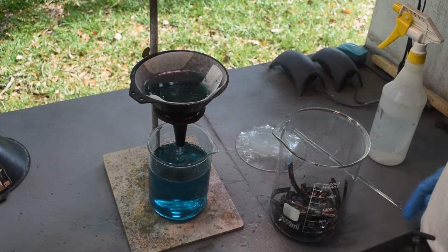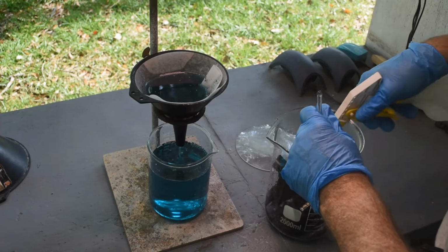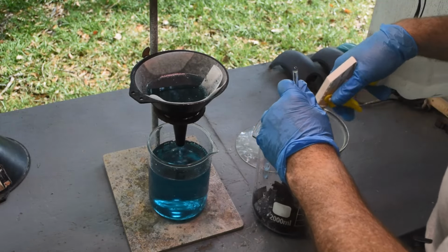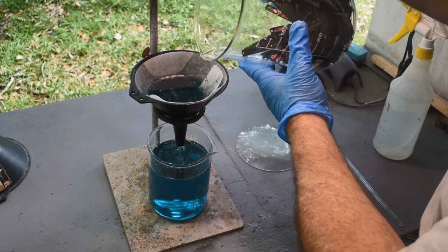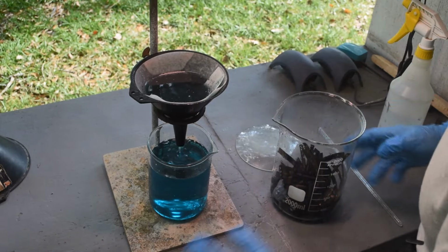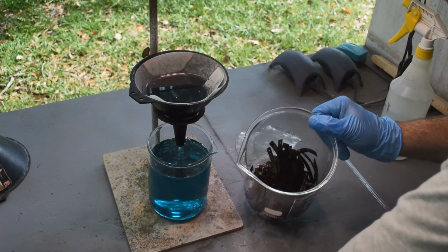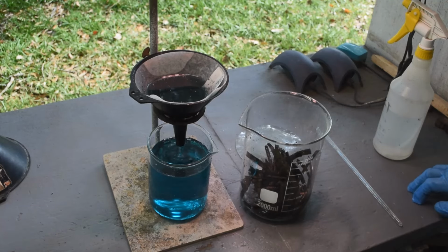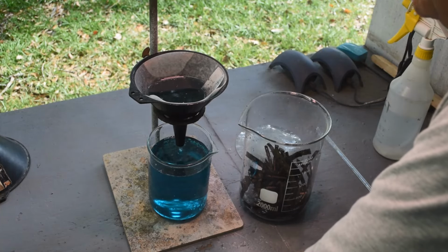All right. So I suppose another way to separate the palladium, Joven, would be to just keep rinsing this stuff with water and stirring it, and then pouring off the water, which contains a whole lot of the palladium. So that's one potential way of doing it. I seem to be getting a whole lot of it in this filter. What else am I getting in the filter, though? That's a good question. I see some dark colored debris. I wouldn't be surprised if there's a little bit of the copper that's flaked off of the substrates in there. So refining the palladium might be necessary before just melting down what's in the filter here to make little ingots of palladium.